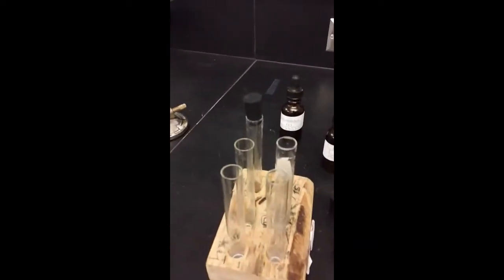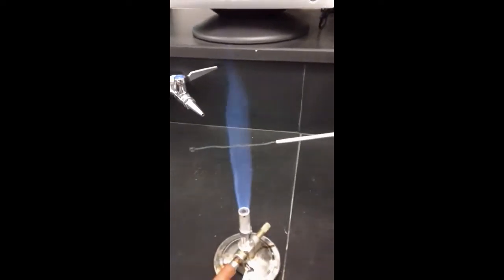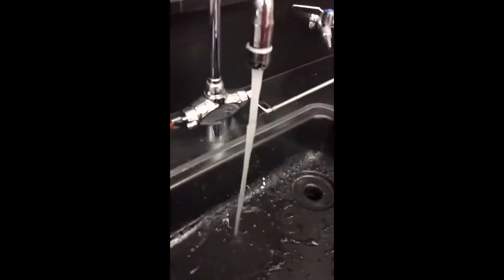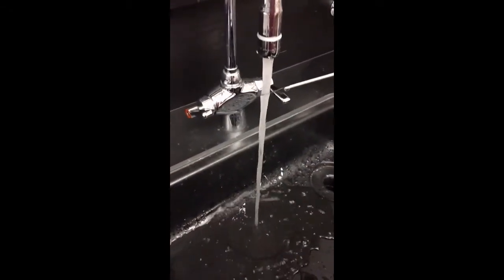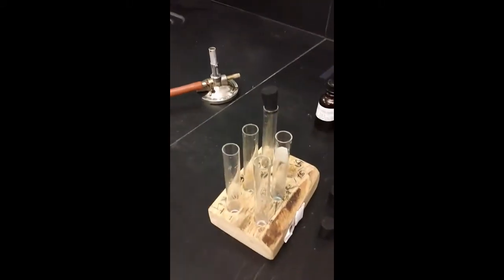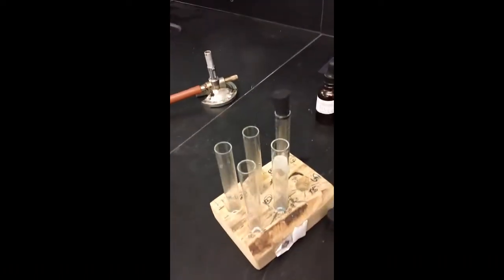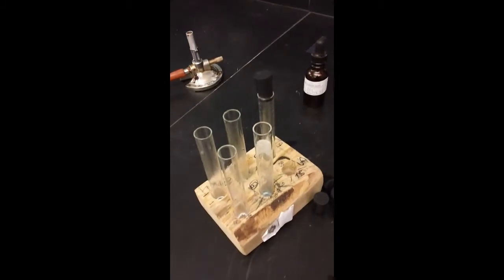So here. Now what I'm going to do is make sure I have a nice clean test rod, and then I'm going to go dump my chemicals in hazardous waste and wash out my tubes before I do test B. So I'm going to shut off the camera real quick while I do that. I'm going to go clean my test tubes. I'm going to make sure I turn my Bunsen burner off. Okay, so I'll walk over chemical waste, put these in there, wash out my test tubes, and then I'm going to go grab 5 more. So the same chemicals, I'm going to grab a new round of them so that I can do test B. So I'll meet you back in a few moments.